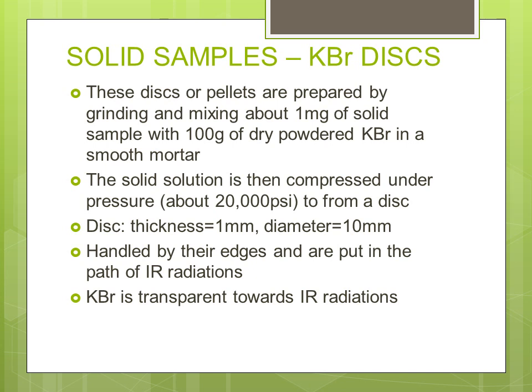These discs are handled by their edges and are put in the path of IR radiations, and in this way the spectra is recorded. And one of the benefits of using potassium bromide is that it is transparent towards IR radiation. That is, it doesn't absorb IR radiations.